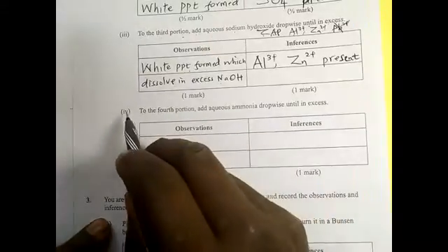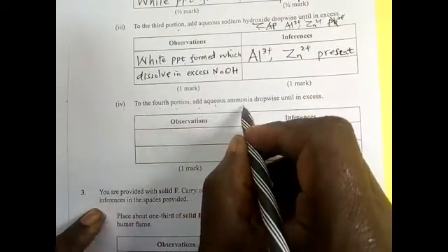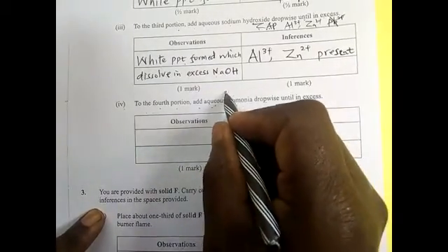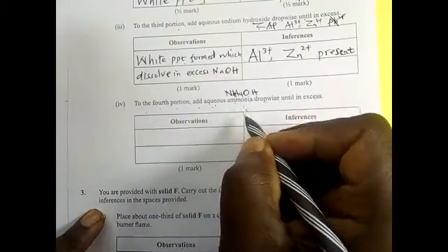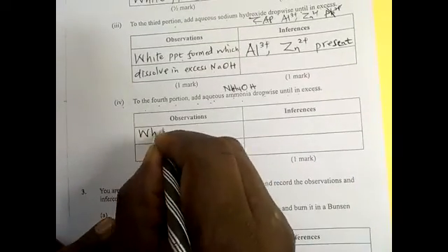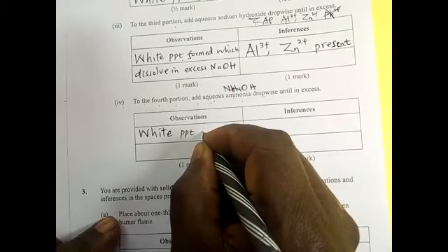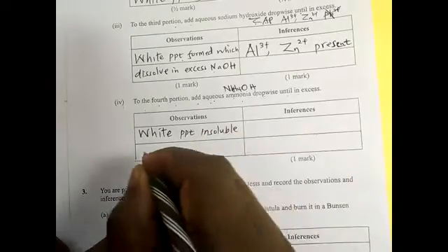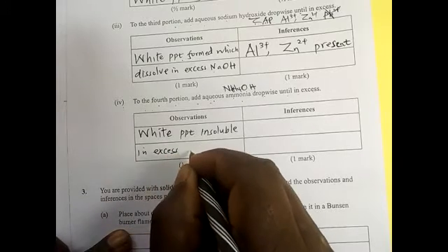Now, Roman 4. To the fourth portion, add aqueous ammonia dropwise until in excess. Aqueous ammonia simply means ammonium hydroxide. Then a white precipitate, white PPT, which does not dissolve in excess, that is insoluble in excess ammonia solution.